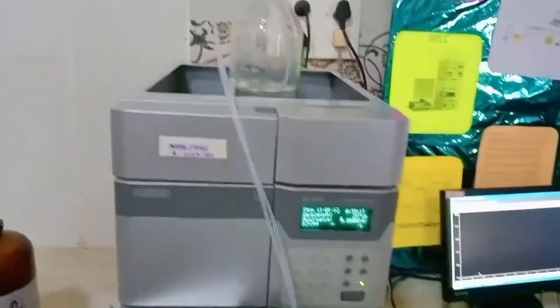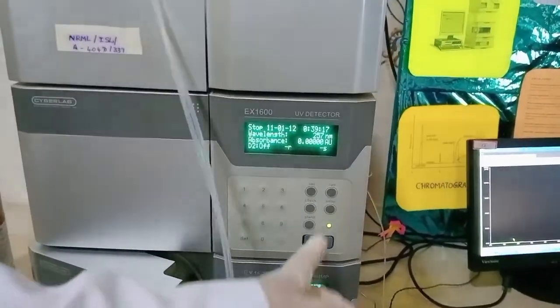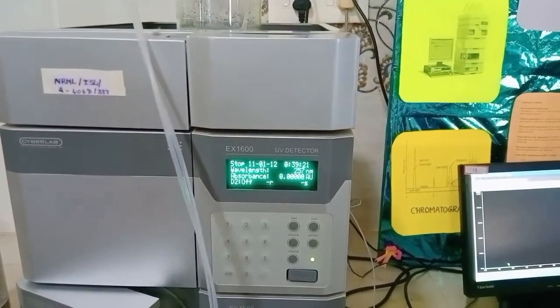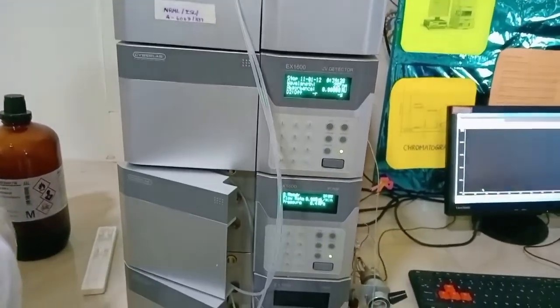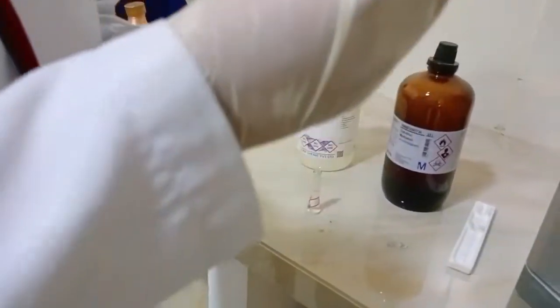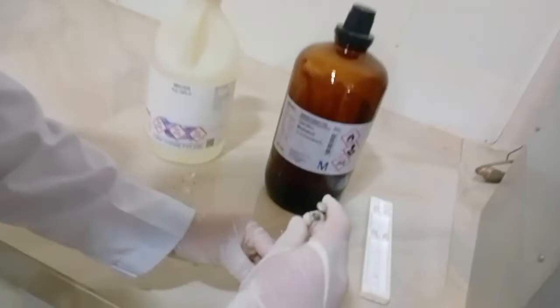Then coming to the pumps, you enter the flow rate as 1 ml per minute and the detector wavelength was 257 nanometers. The sample was injected into the injector port using the Hamilton syringe. The solution was sucked into the Hamilton syringe.